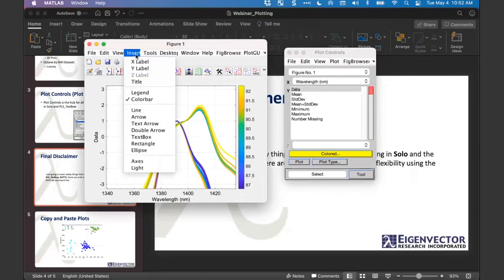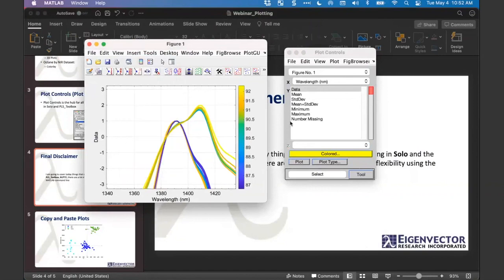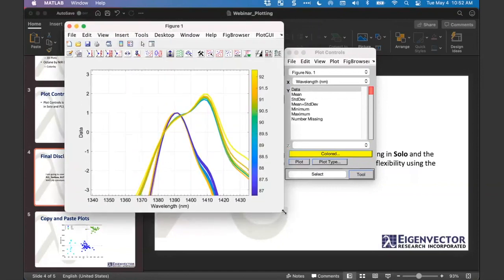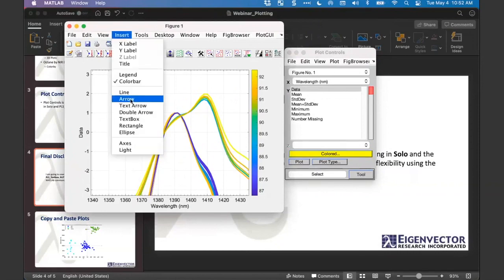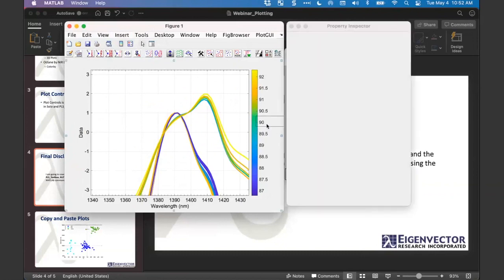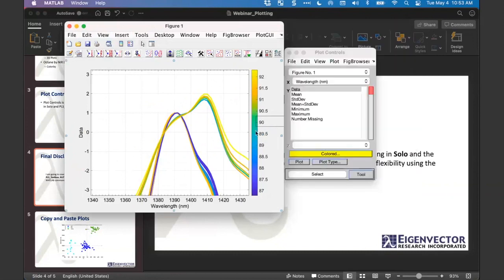Yep. And text box. There you go. Down the list there. And I'm guessing, I didn't see if it added something there. Let me do it again. Text box. Huh. Oh, it is there. It's just that I think it's on the.